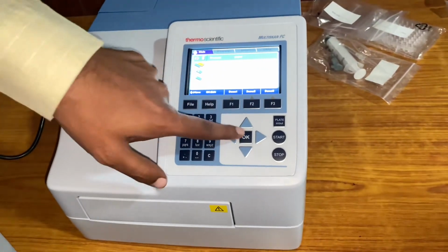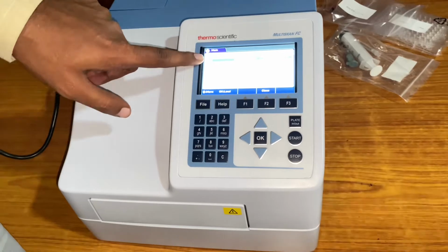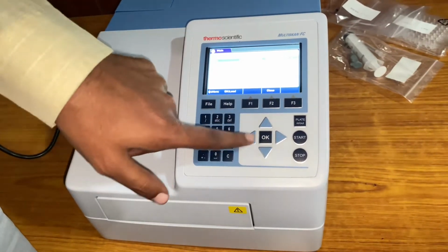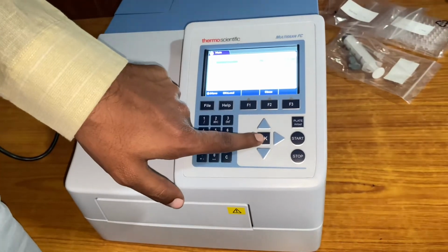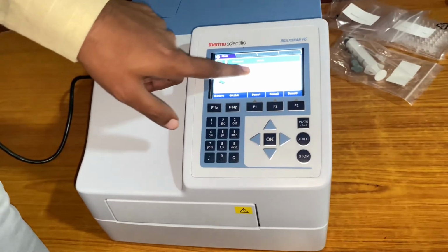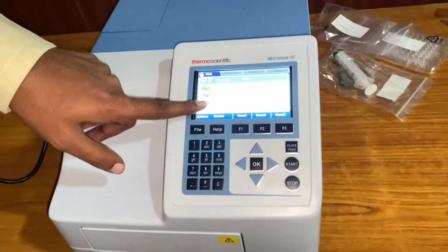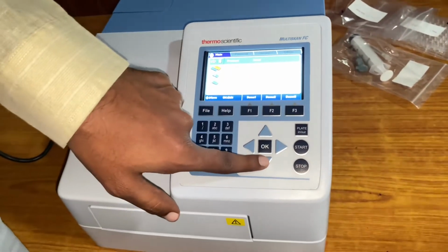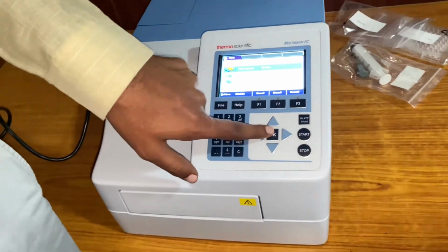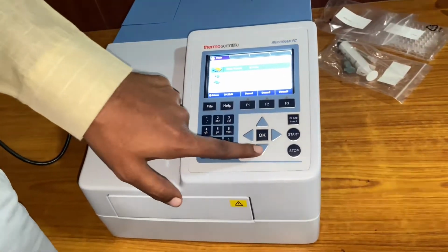In protocol, if you say OK, there are certain demos, demo 1, demo 2 like that. Maybe I will just say demo 1, OK. So in demo 1, what is there? It is 96 well, measurement 405 nanometers reading, shaking is no. If you want to do any changes, you can just select here. It is a 96 well plate, there is no change in this.